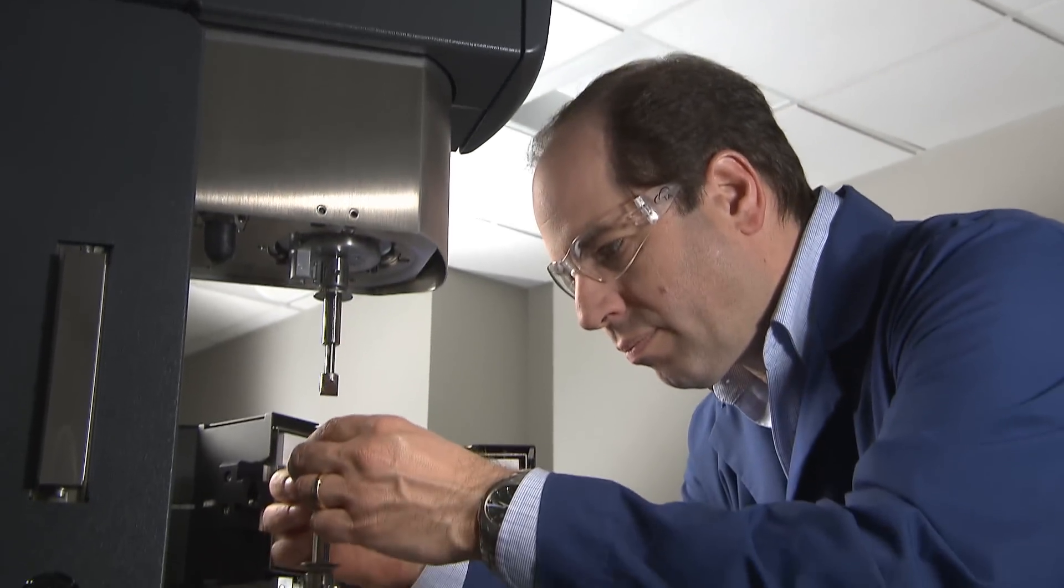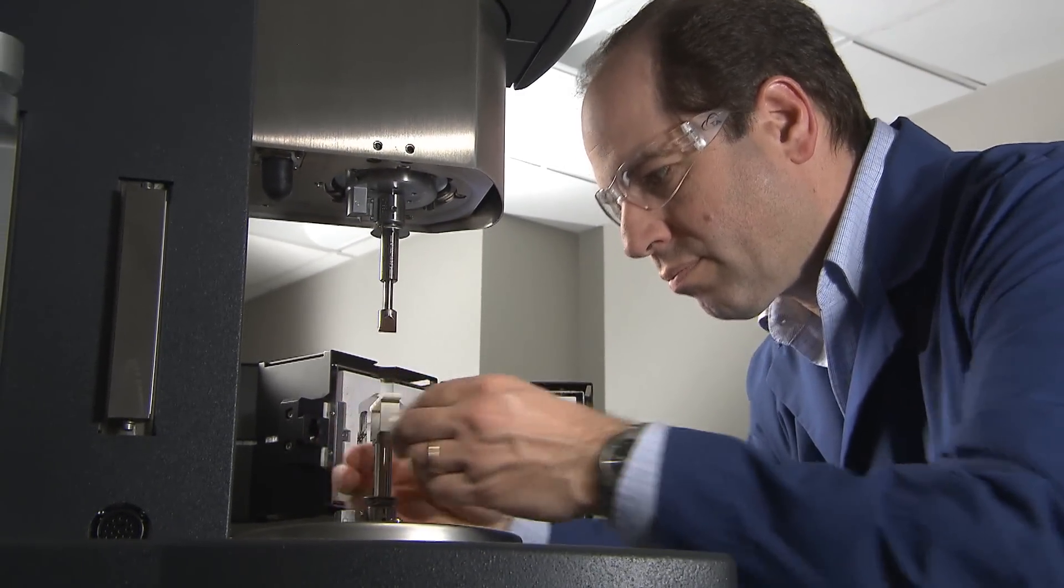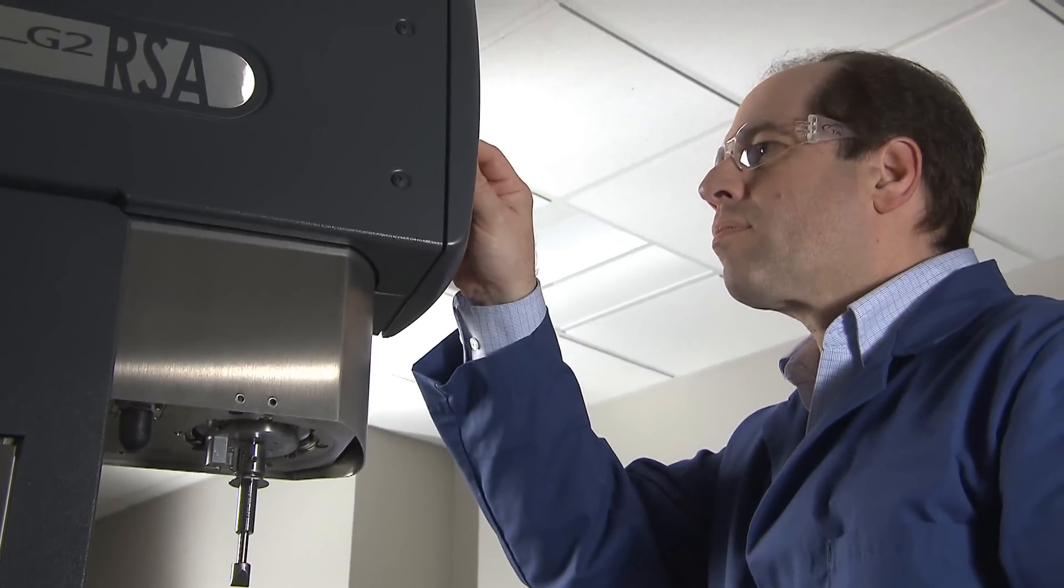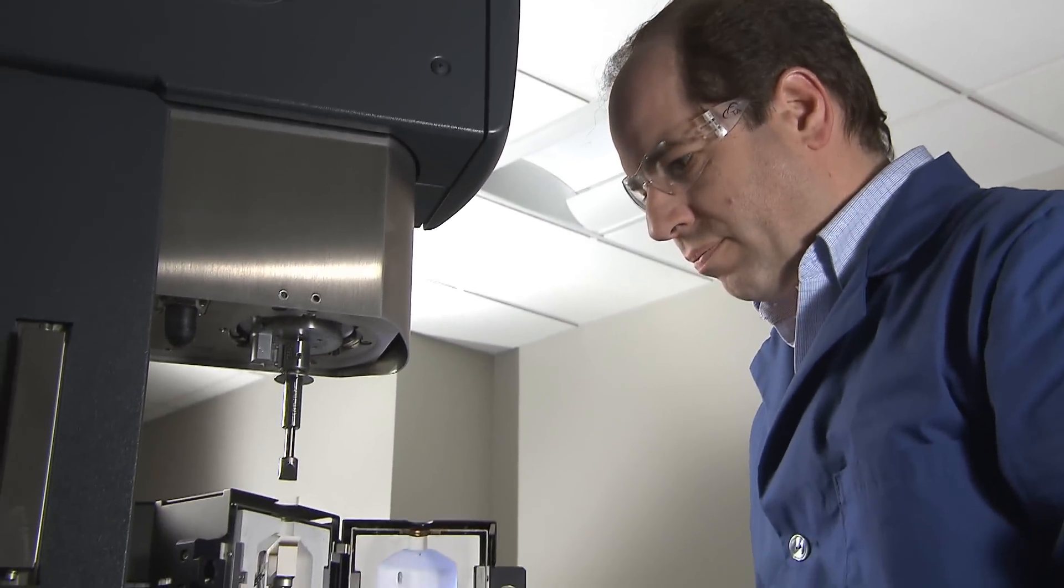The clamps allow for fast and easy loading directly at the test station. No time-consuming and complex external loading steps are required.